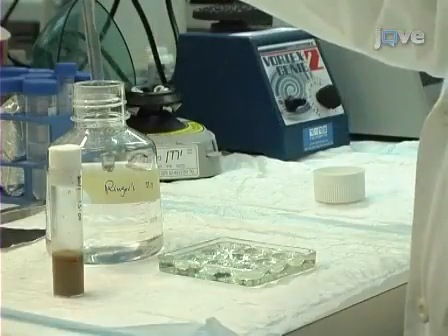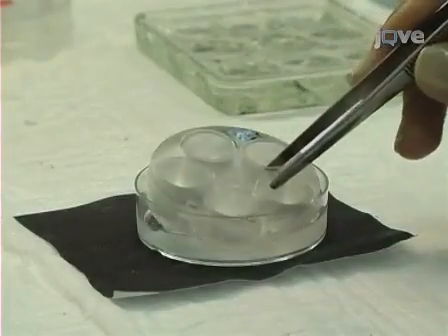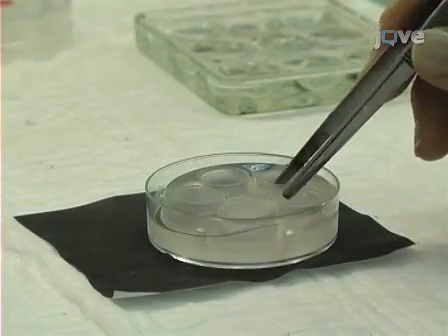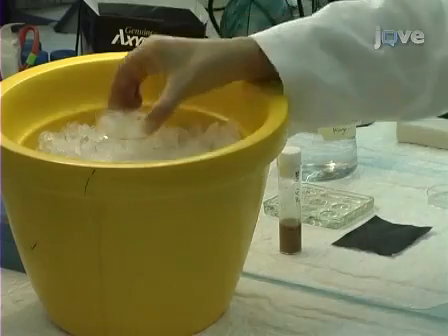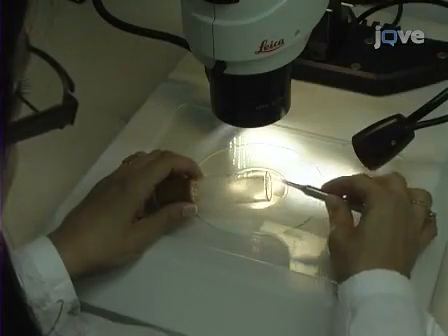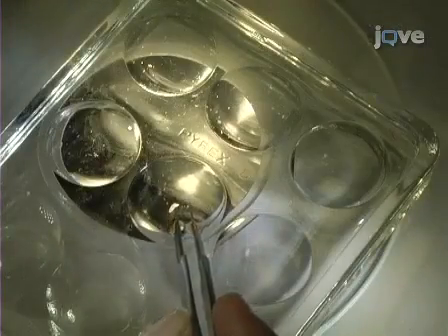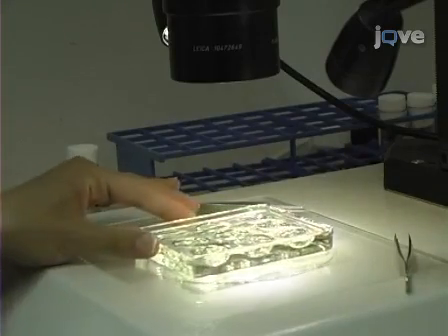Fill a 9-well glass dissecting dish with Ringer's medium. Next, prepare specially-made molds fitted with a nylon mesh in the petri dish containing Ringer's medium. Place the dish on ice. Using fine forceps, pick 10 to 15 larvae from the vial walls and place them in the dissecting dish. Place the dissecting dish under a microscope for female selection and dissection.